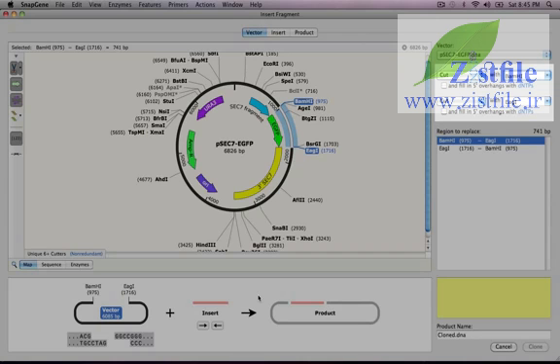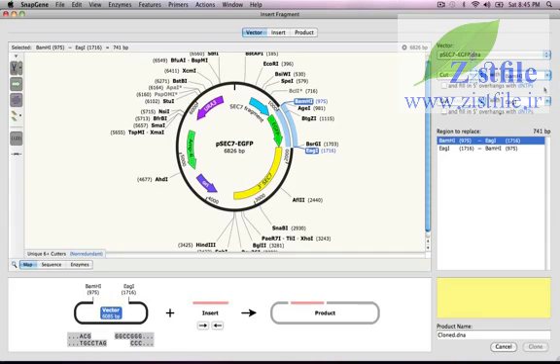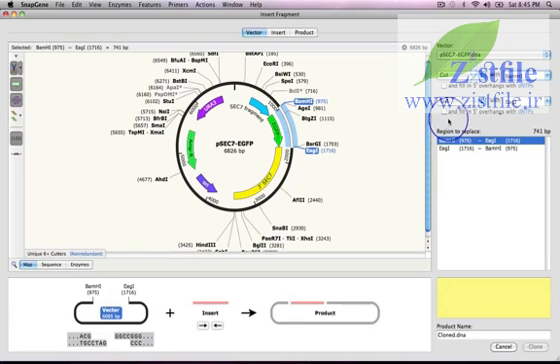At the upper right are controls for selecting enzymes. My two enzymes, BAM-H1 and EAG1, are already listed here. If I needed to blunt one or both of the sticky ends, I could use these checkboxes. But for this cloning, I'll keep the sticky ends.